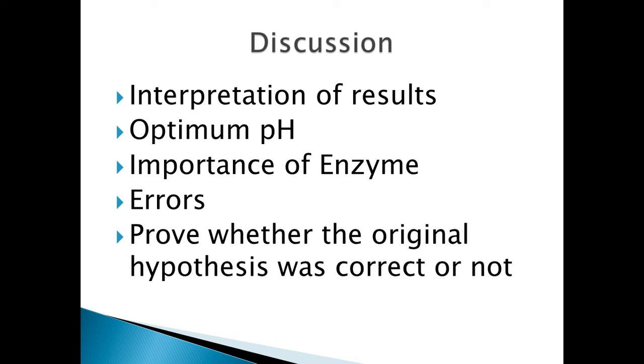There are no specific errors in this experiment, but one thing might vary the optimum pH level. When the cuvettes were set into the spectrophotometer, fingerprints might have remained and the absorbance of light could not be perfect. Since they were just checked by eye rather than running some tester, it might cause a slight difference.